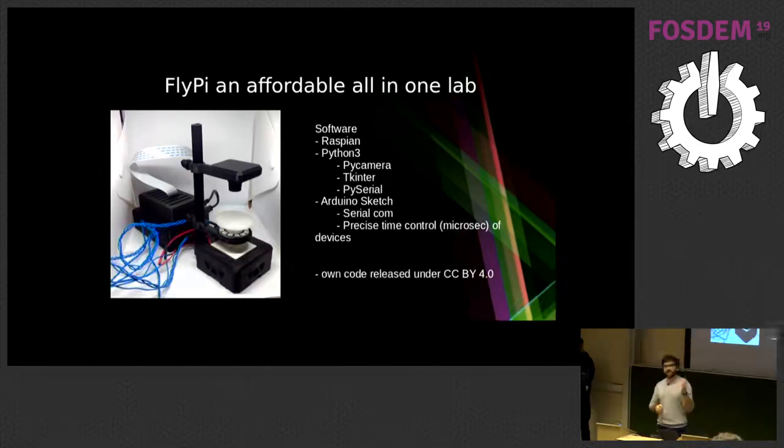So the application with the automated focus is still not complete. Right now it's really just pressing a button and making it move. So we don't have the algorithms to make it automated yet.